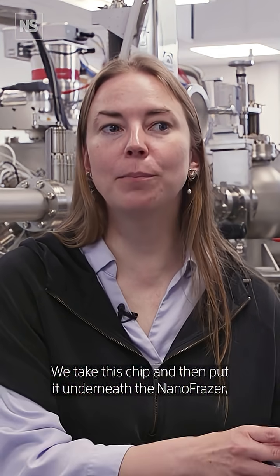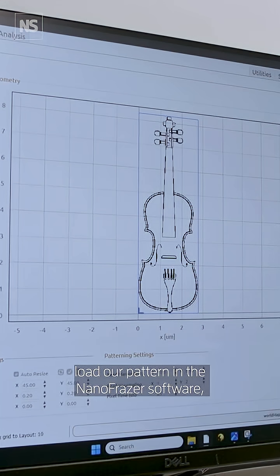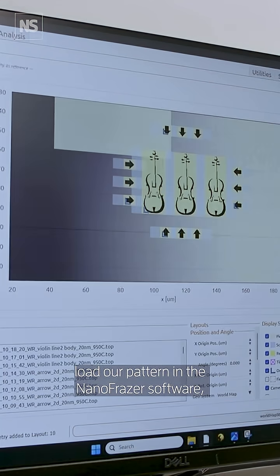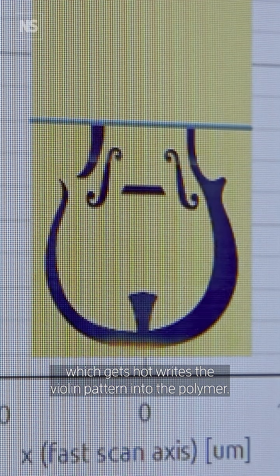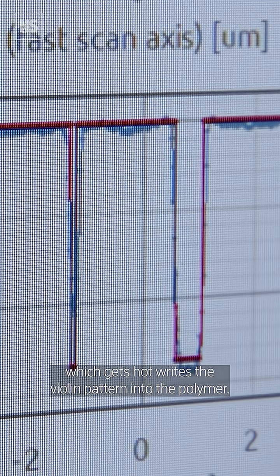We take this chip and then put it underneath the nanofraser, load our pattern in the nanofraser software and then set the parameters so that the small tip, which gets hot, writes the violin pattern into the polymer.